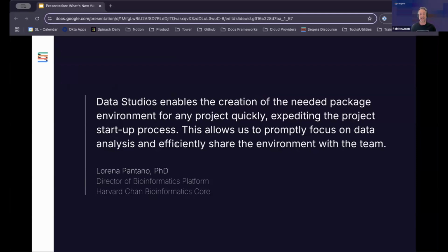The top 3 benefits of using Data Studios that we've heard are the ease of use in setting up a ready-to-work scientific analysis environment, simple and secure access to your cloud-hosted data and any publicly available cloud storage bucket, such as the Registry of Open Data on AWS, and that other people can collaboratively join sessions or help troubleshoot analyses.